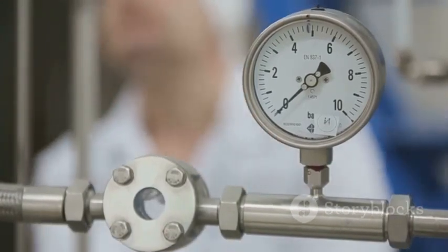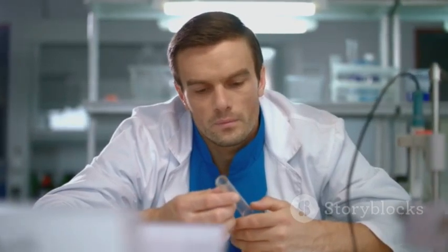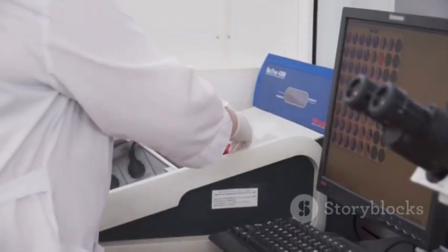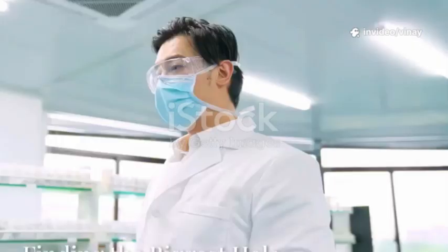They use air or water pressure to probe the filter's structure and confirm that its largest pores are still smaller than the minimum size required to stop bacteria. It's a clever way to ask the filter, "Are you okay? Are you ready to do your important job of protecting patients?" Without this confirmation, we would just be guessing. And in medicine, guessing is never an option.